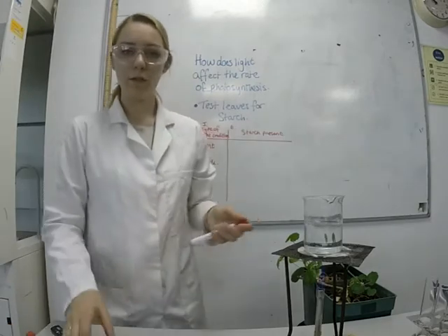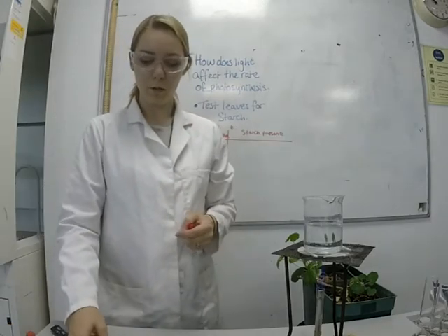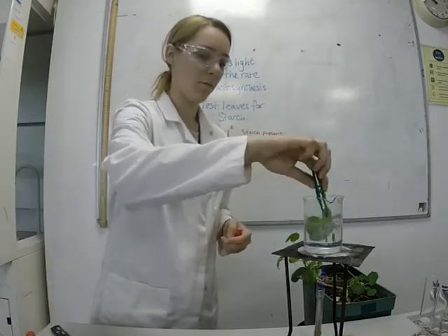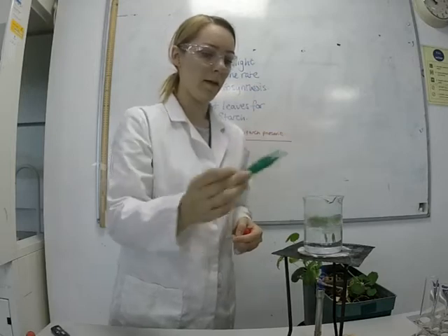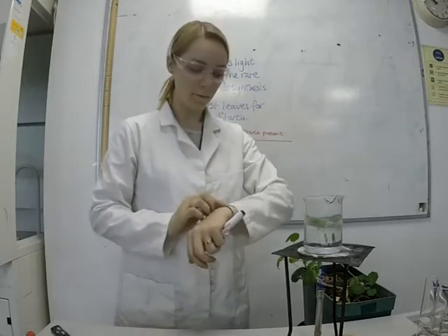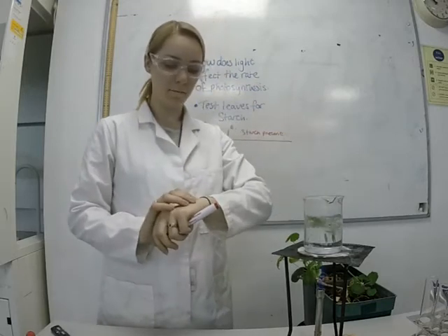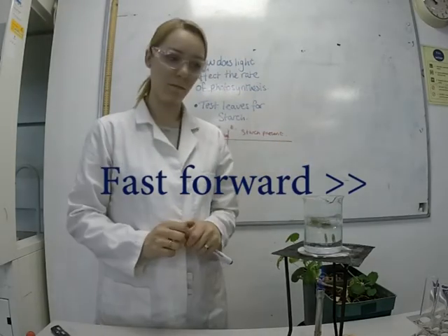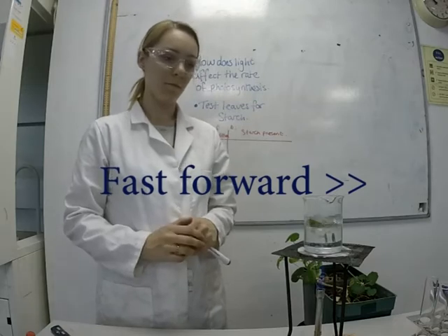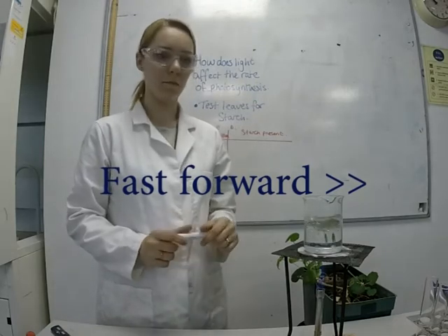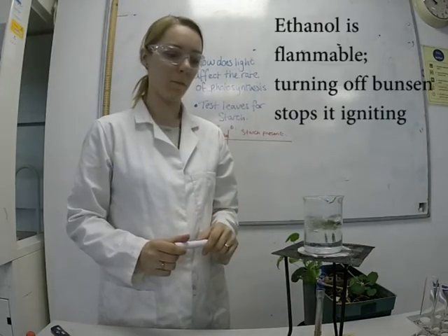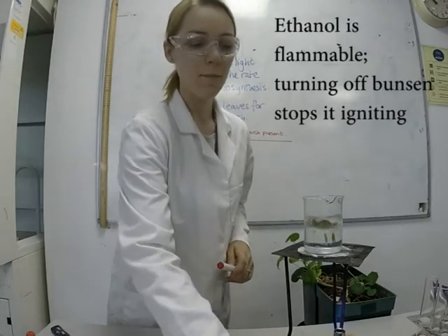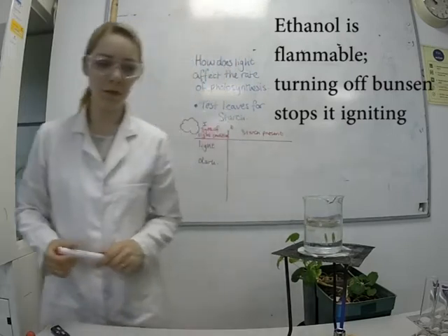The water has now started to boil, so I can add the leaf and time 30 seconds. That's 30 seconds up — I can now turn off the Bunsen.